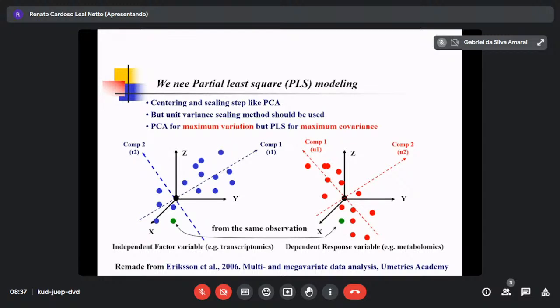Then you have to consider also the character. If you put 1, 2, 3, are they related or not? For example, does 3 mean it is 3 times higher than 1 or not? That is a related one.